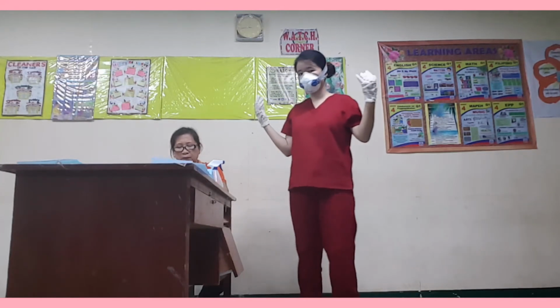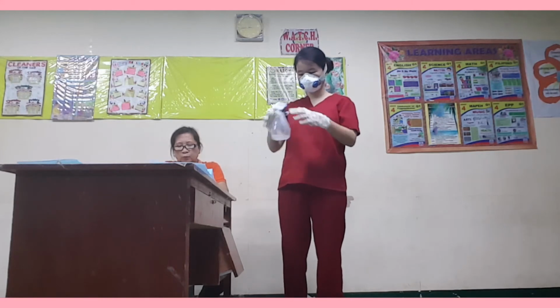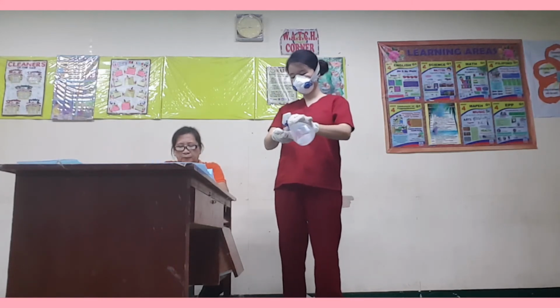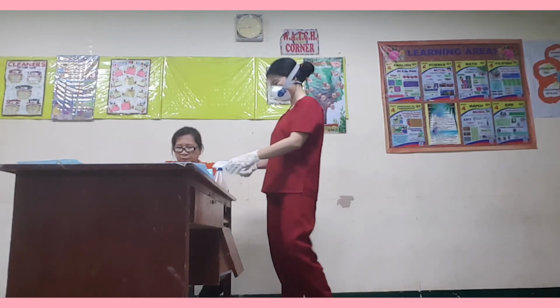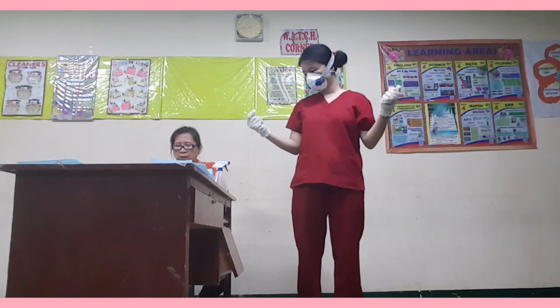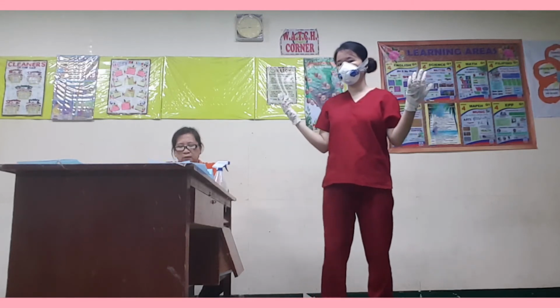Procedure number 15. Disinfect inner gloves. Use 1:10 bleach disinfectant or alcohol-based hand rub (ABHR) to remove microbial pathogens and thus prevent the transmission of disease and illness.